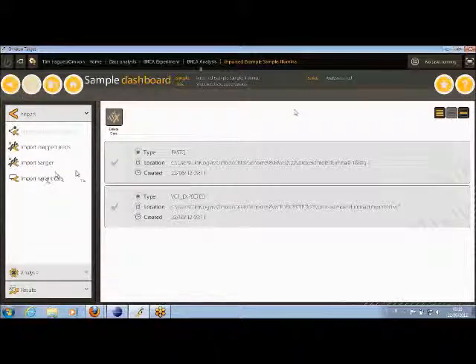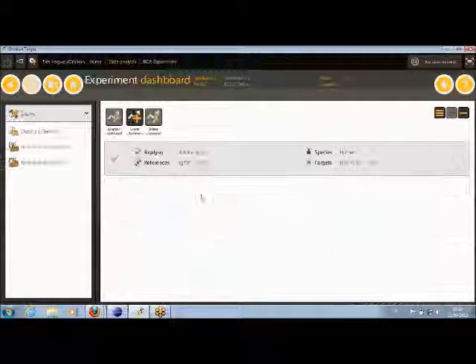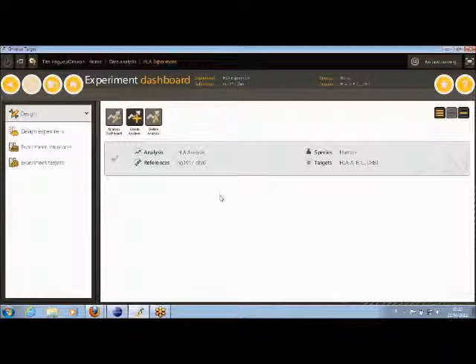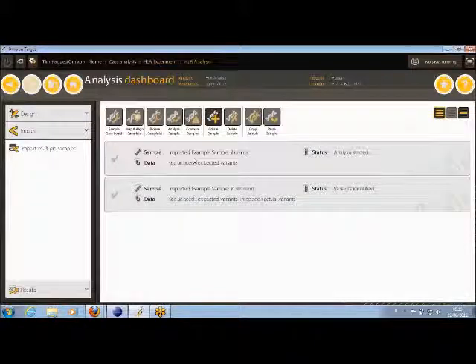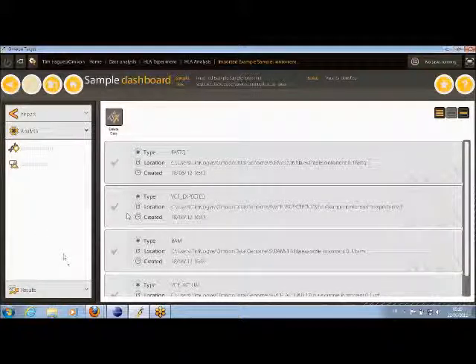So instead, I'm going to go back up and show you what I did earlier. This is actually within the HLA side of the tool. In here, I've imported already the HLA. I've added the HLA profile earlier on. If I click into the default HLA experiment that's created by that process, HLA analysis, then in this case I chose to import some example data for both Illumina and Ion Torrent, and this is an Ion Torrent set. This one has been run through the map and align process, so that's no longer available on the list.